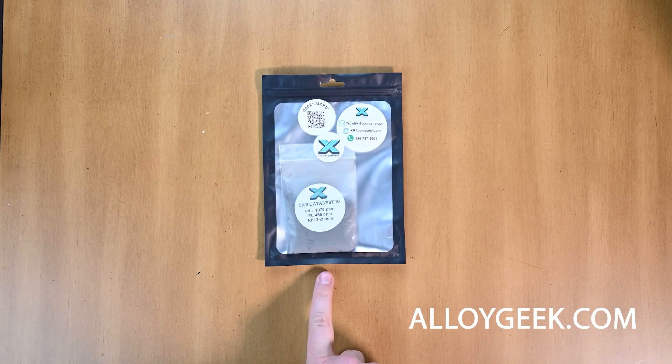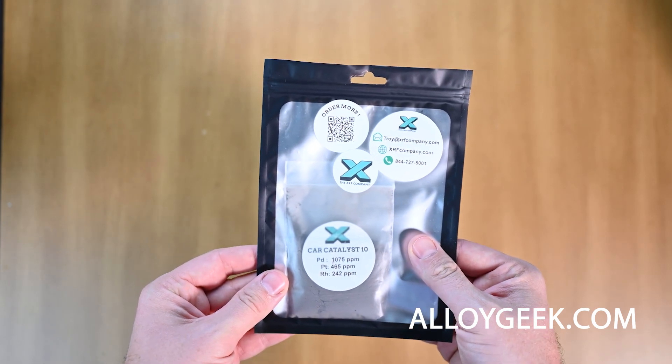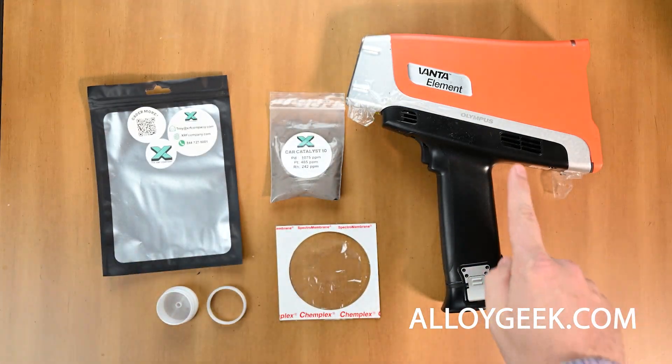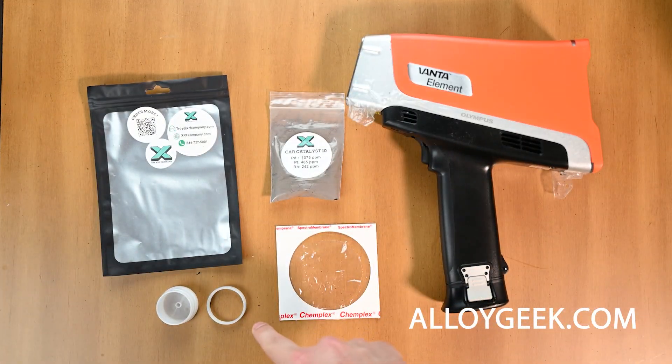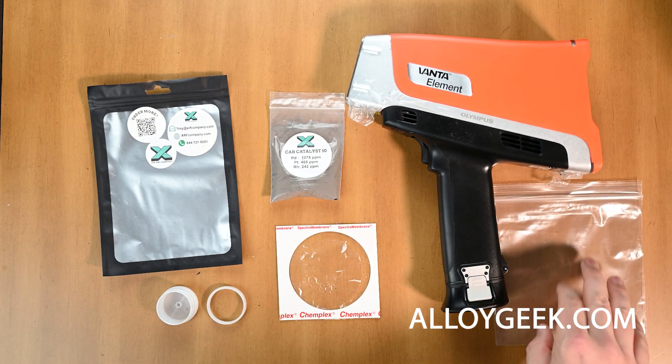In this video, we're going to look at how to test catalytic converter material with a handheld XRF. The first thing we're going to need to do is gather everything, including our handheld XRF with catalytic converter mode on it and our sample prep materials.